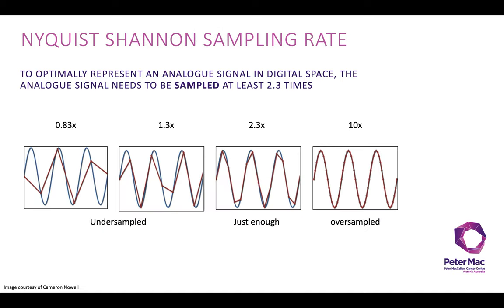Fortunately, there's an equation to help determine appropriate sampling — the Nyquist-Shannon sampling rate. This states that to optimally represent an analog signal in digital space, the analog signal needs to be sampled at least 2.3 times. At 0.83× we're undersampling — the digital representation doesn't match the analog signal. At 1.3× it's getting closer. At 2.3× the digital sampling is pretty close. At 10× it's a much better representation, but this may be oversampling.